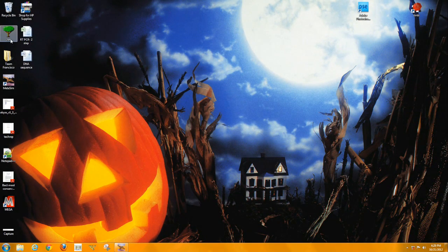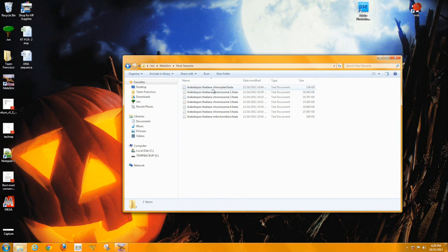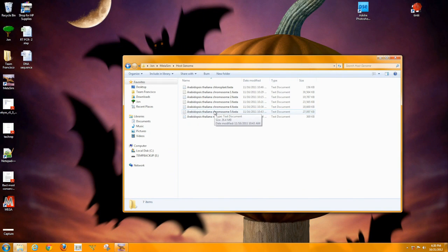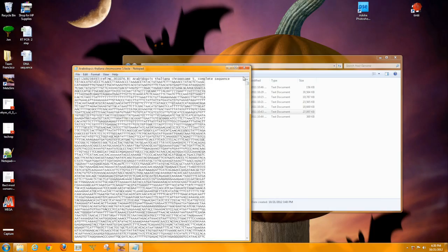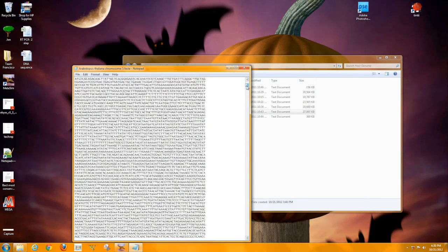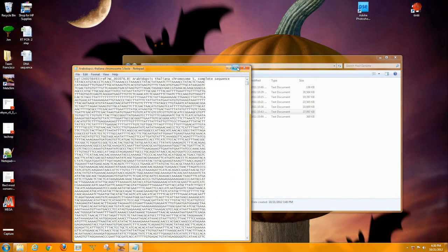To get started, one of the first things you'll want to do is go on NCBI or the DNA Database of Japan, or whichever database you want to use, and download whatever host you want. In this case I'm using a eukaryotic plant host, but that doesn't mean you have to use plants. You can use any kind of host you want. I've used soil as a host before, and we've used various foods as hosts. So it really doesn't matter.